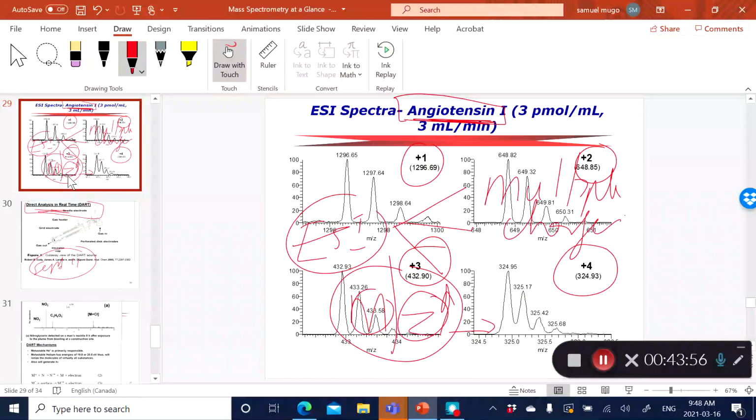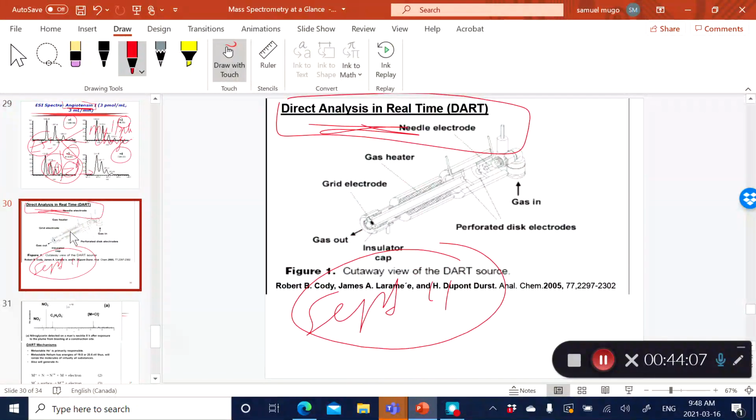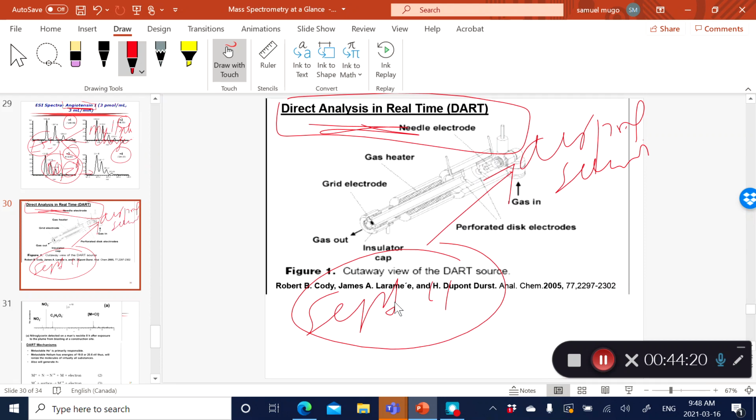So you're doing ionization in an atmospheric pressure environment, meaning you can use it easily in the environment without needing a vacuum. Because of that, people thought they could develop the technique for airport security as well, especially to sniff things like drugs, and possibly things like bioterrorist agents and so on.